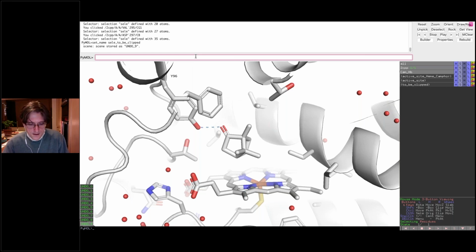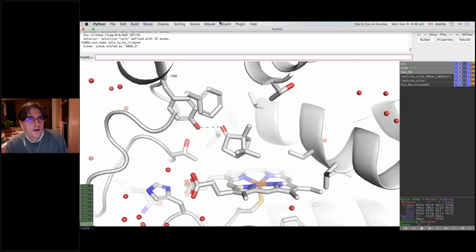All right. So next up is ray tracing. So what I'm going to do is type in ray, and you can either just type ray. We have a quick question that might be useful here. Yeah. Can we display hydrophobic contacts? So yes, you could if you want. Of course, you have to decide what is a hydrophobic contact. Probably the best way, and it's manual. It's not automatic. So you have to choose.